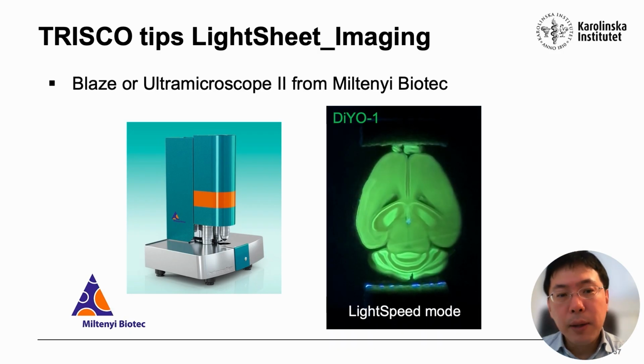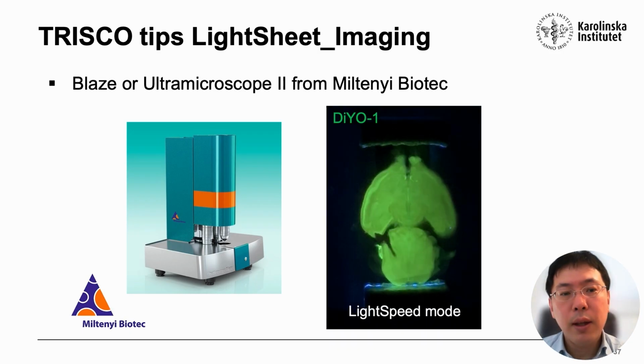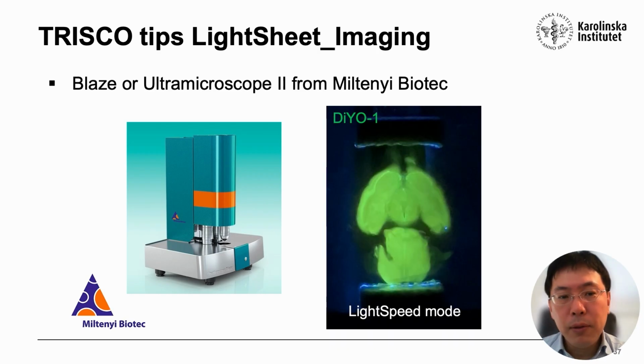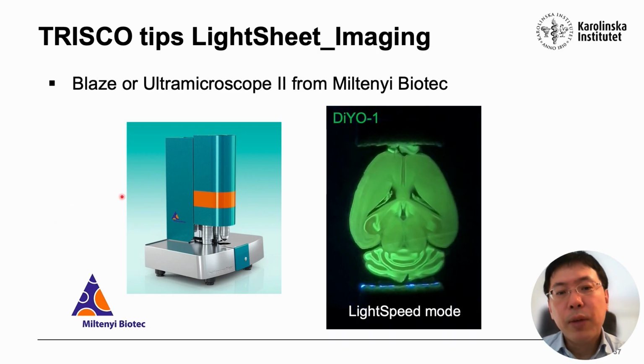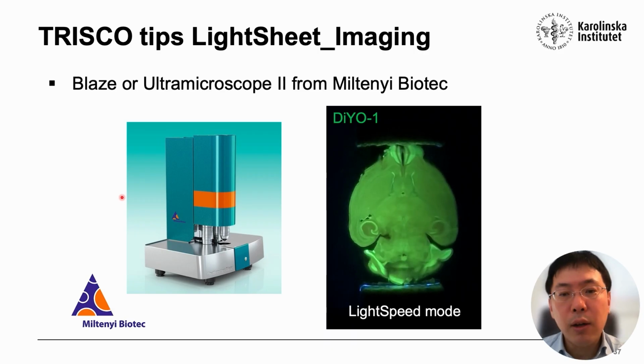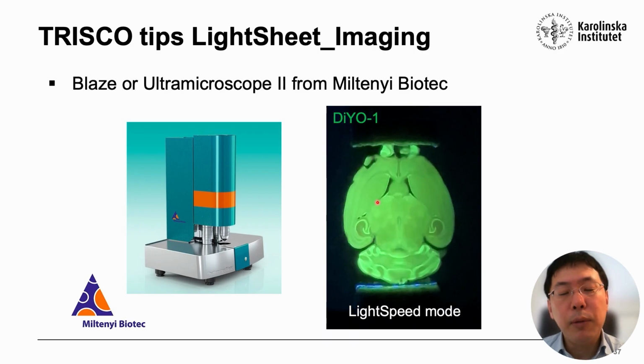The final step is imaging with light sheet microscopes. I recommend the Blaze system or UltraMicroscope 2 from Miltenyi Biotec, as these systems are highly optimized for organic solvent cleared samples and extremely user-friendly.